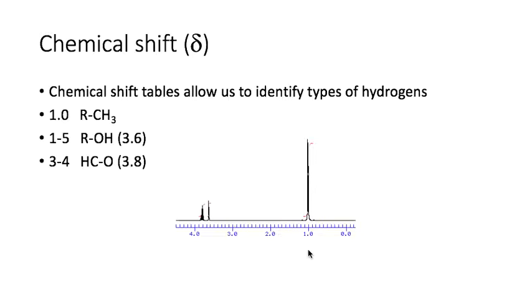There'd be a slight shifting if it was a CH2 group with 2 carbons, 1 on either side, or a CH group with 3 carbons on the other sides. Carbon versus hydrogen is a slight difference. So this peak here is pretty indicative of a methyl group, there being 3 hydrogens on a carbon.